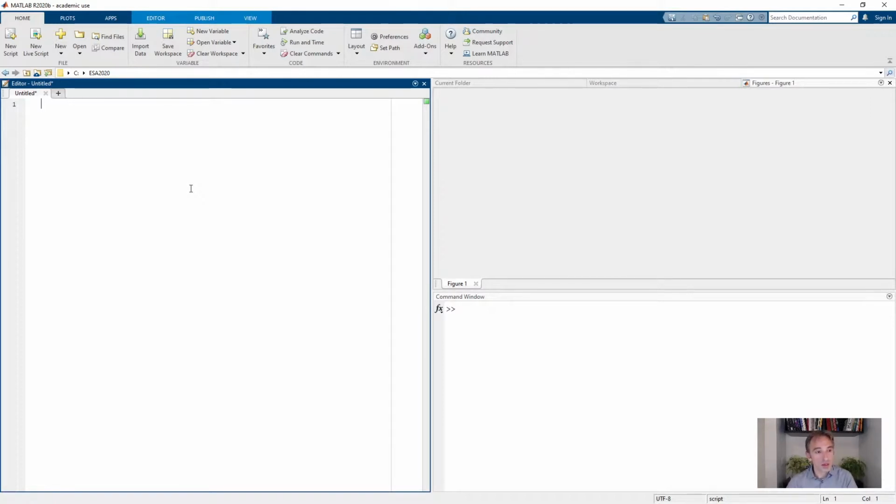Let's start with a very simple example. Again, let's clear everything out here. Define a spin system with now 3 G values. Let's say the Gx is 2.10, the Gy is 2.10, and the Gz is 2.56. This will be typical for a nickel 1 species.